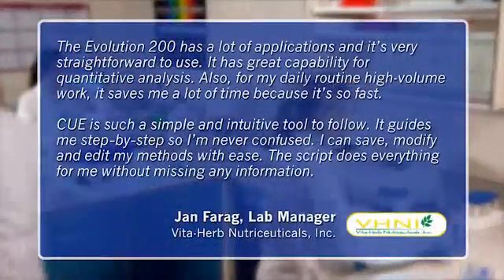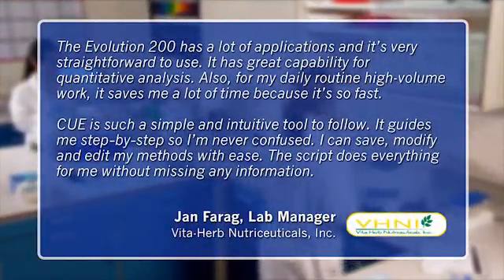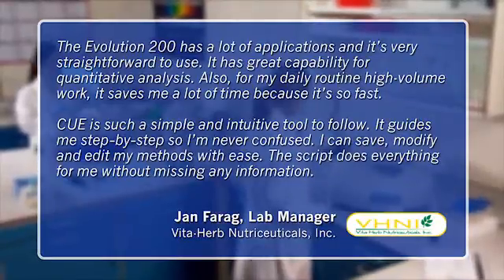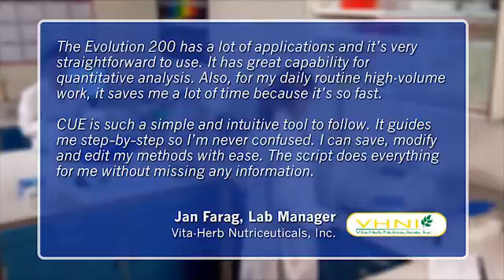The Evolution 200 has a lot of applications and it's very straightforward to use. It has great capability for quantitative analysis. Also, for my daily routine high-volume work, it saves me a lot of time because it's so fast.